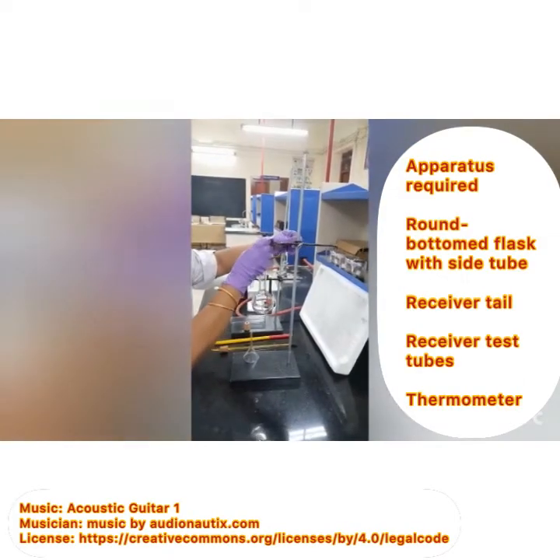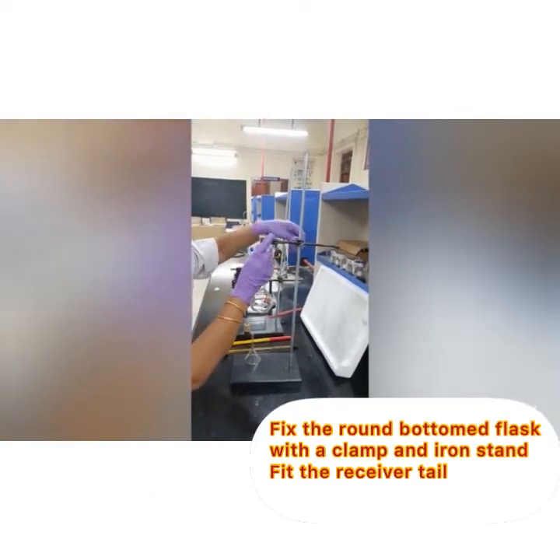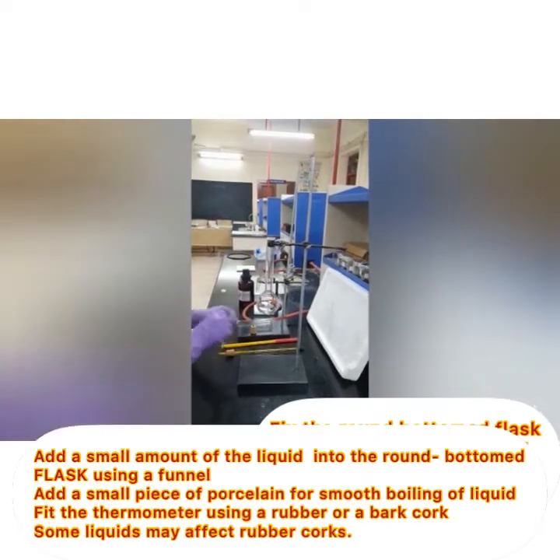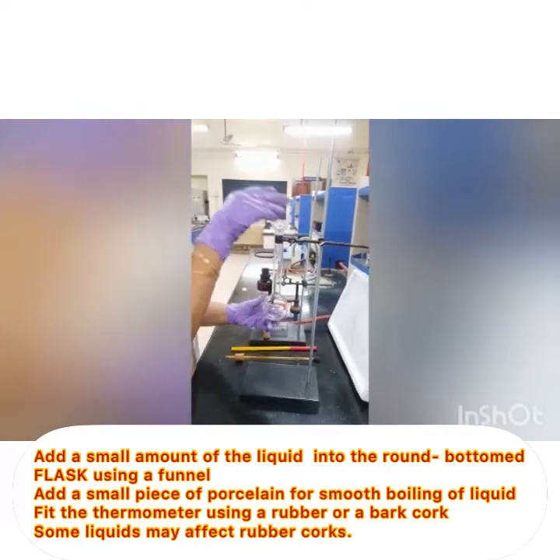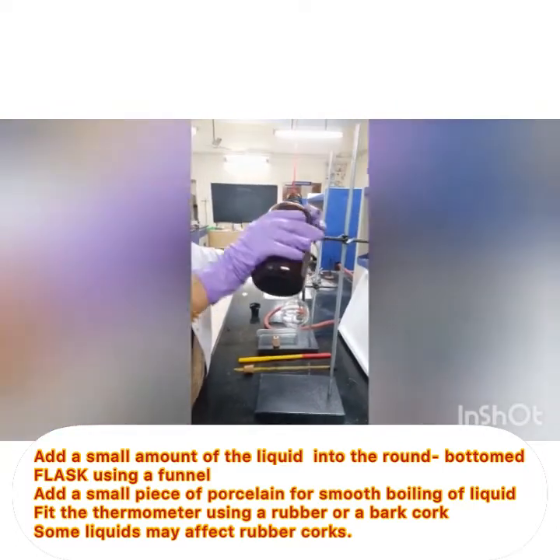Hi friends, we will now see the distillation of a small amount of a high-boiling liquid. I am showing the setup: a small round-bottom flask with a side tube is needed. It is clamped with the help of a clamp and an iron stand. I am now pouring a small amount of a high-boiling liquid.